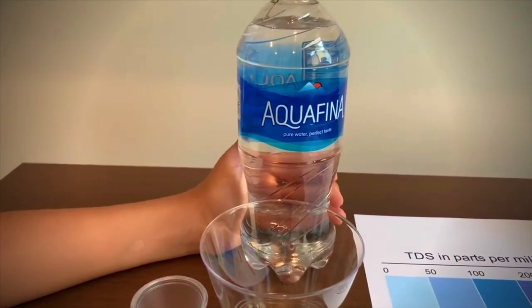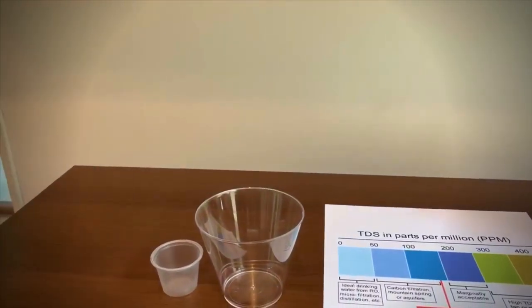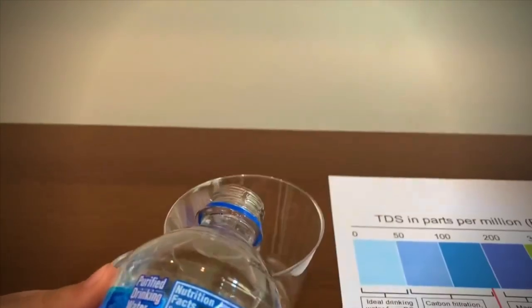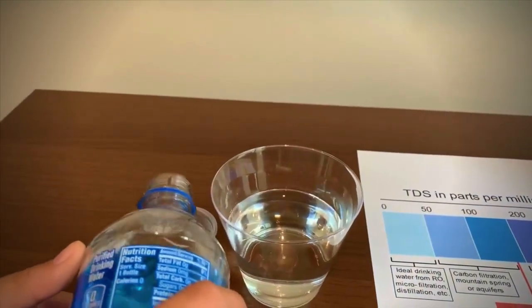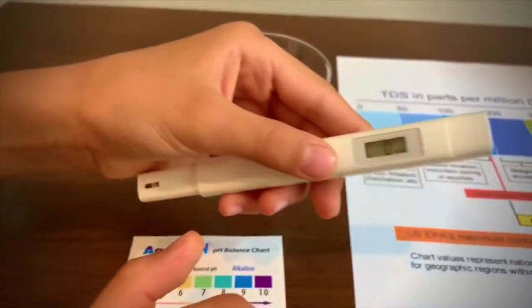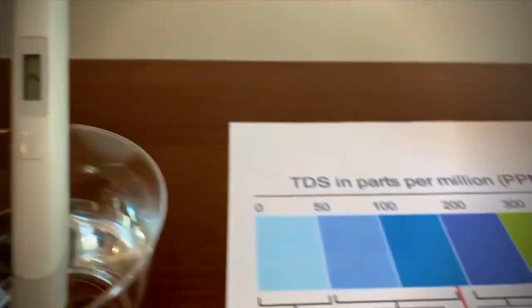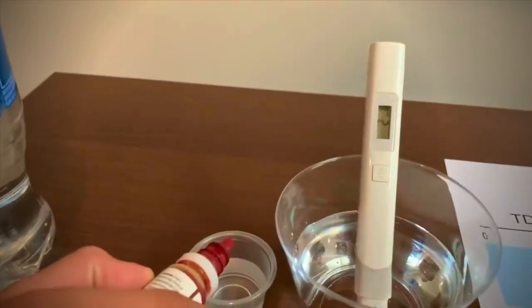This is a good one. It's Aquafina purified water. Let's test the TDS and pH. Now let's test the pH level. Two drops on this.